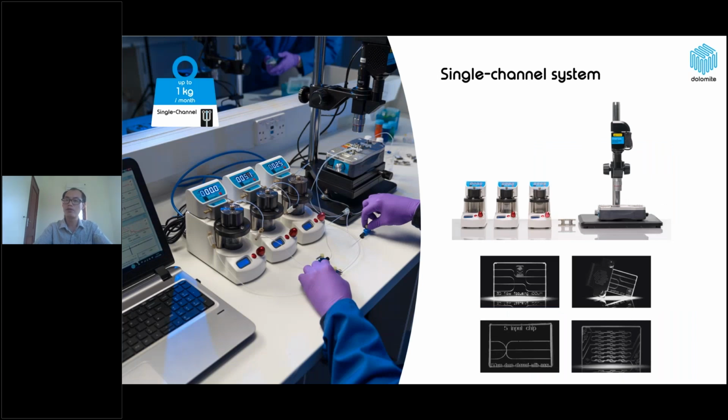Here's a single channel system for liposome or lipid nanoparticle synthesis. Basically, the system includes three pumps to drive the fluid or reagent into the microfluidic chip, which is located under the microscope integrated with high-speed cameras.